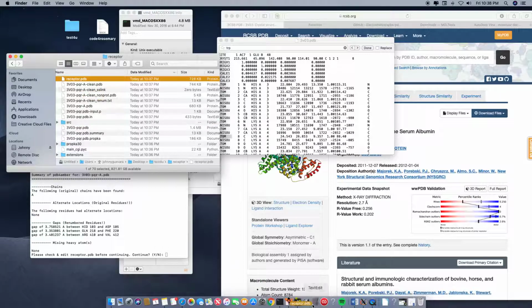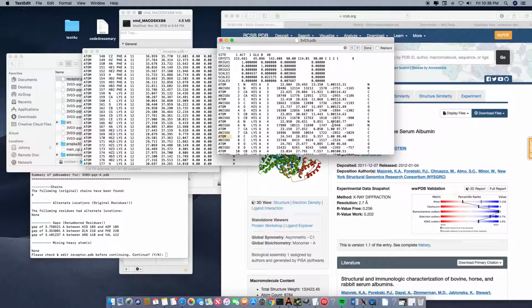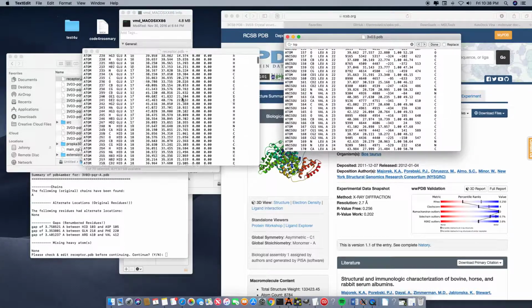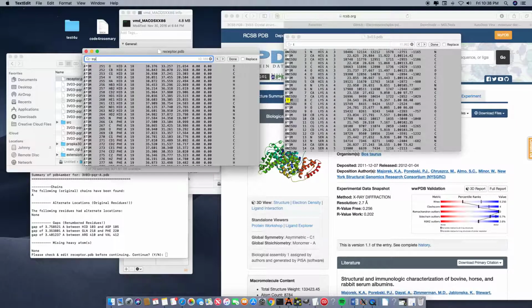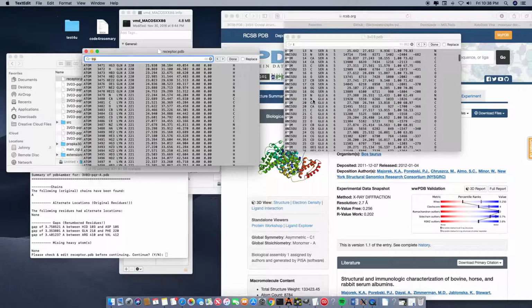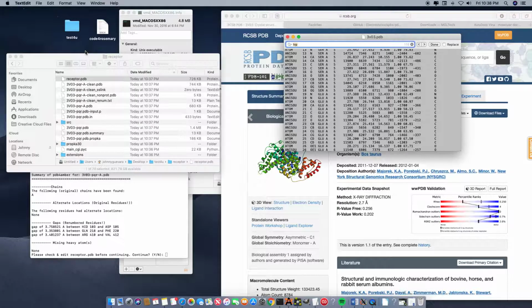But basically, go ahead and look at this receptor. It's pretty clean compared to this one here. This one's all dirty, you could say. So that's good. We want to see if all the residues are labeled correctly. So I see 134, that's good. That's how it's labeled in BSA. And 213, that's how it's labeled in BSA. So that's good, we can go ahead and leave it like that. All the hydrogens have been added that weren't there previously. That's important. So it's good, we can continue.